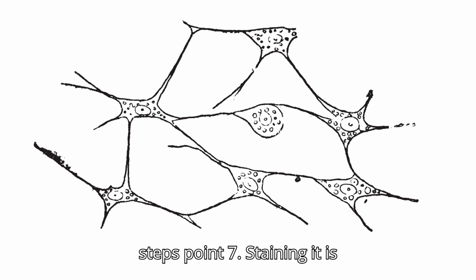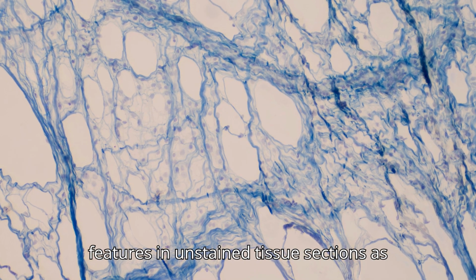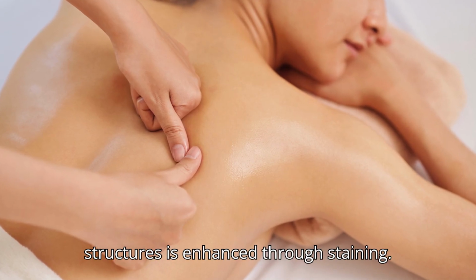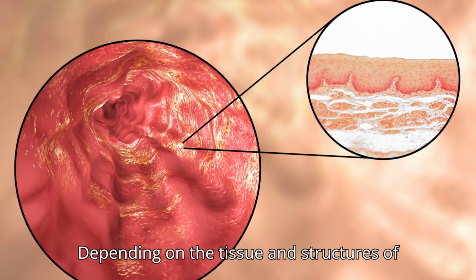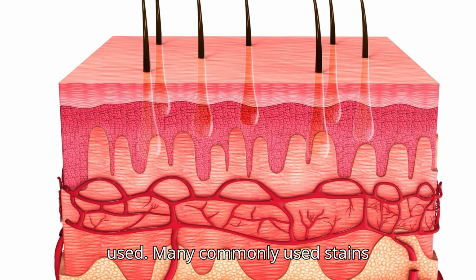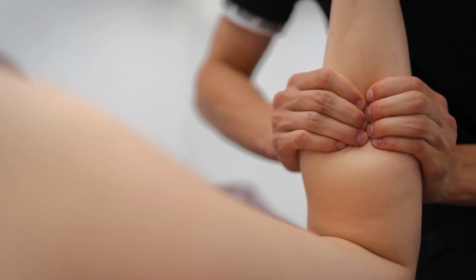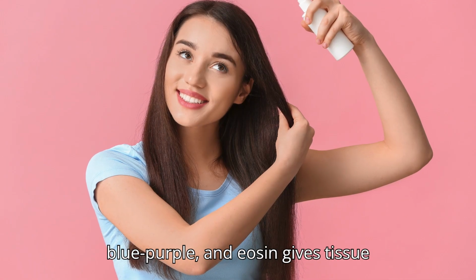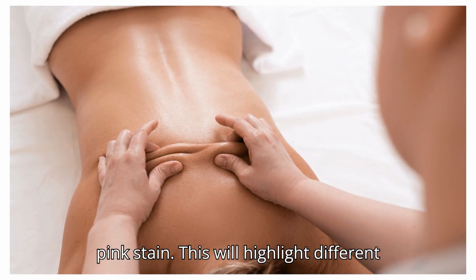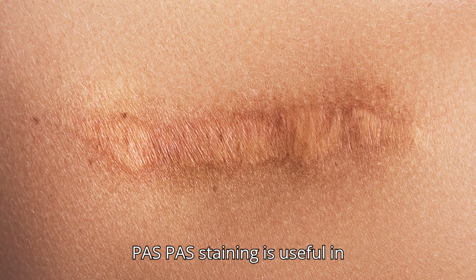After the above steps, 7. Staining. It is rather difficult to distinguish cell features in unstained tissue sections as they are nearly translucent. Contrast between various tissue structures is enhanced through staining. Depending on the tissue and structures of interest, several types of stains are used. Many commonly used stains include hematoxylin and eosin, H&E, the stain which histologists use the most. Hematoxylin stains cell nuclei blue-purple, and eosin gives tissue components, including the cytoplasm, a pink stain. This will highlight different tissue components clearly, which is important to understand cell morphology.